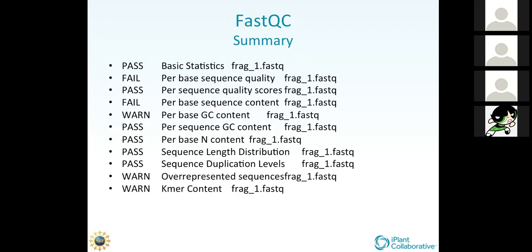Well, I'm going to give them some credit right now and say, okay, this stuff, running FastQC is pretty straightforward. And as I hinted before, if you really have a question about FastQC and how it works, the best way to find out is just by putting sequencing FastQC in Google and looking for the manual for FastQC. So that's what I do when I have questions.